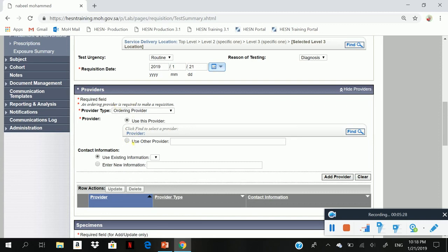For provider type, we can use ordering. You should select ordering provider, and you should select Dr. Ahmed Hamid, for example, his name, and add provider.